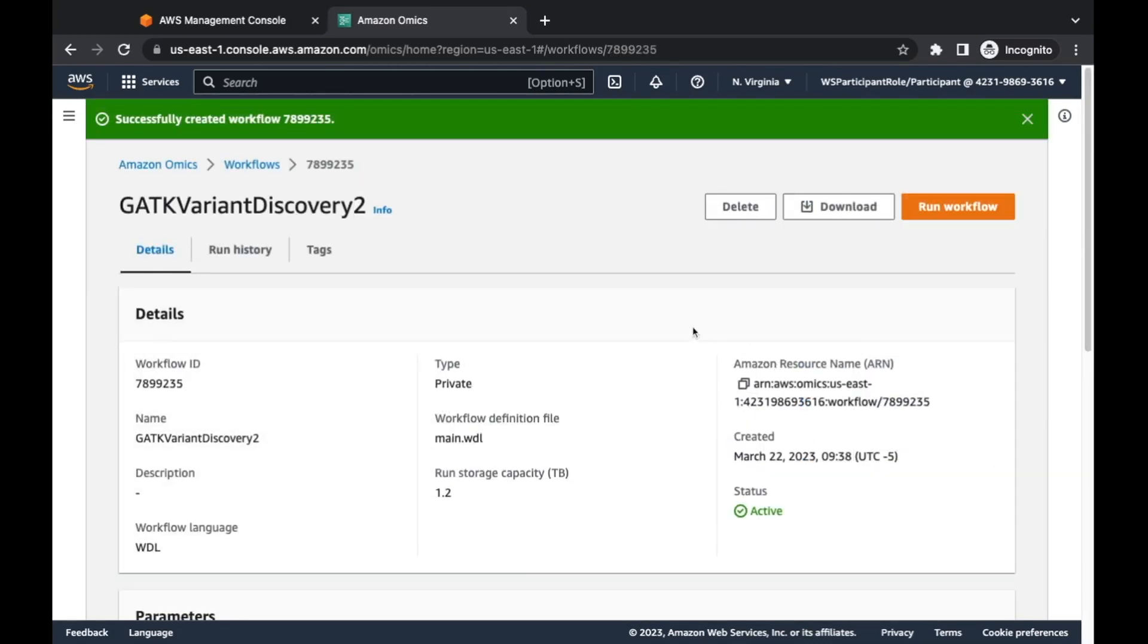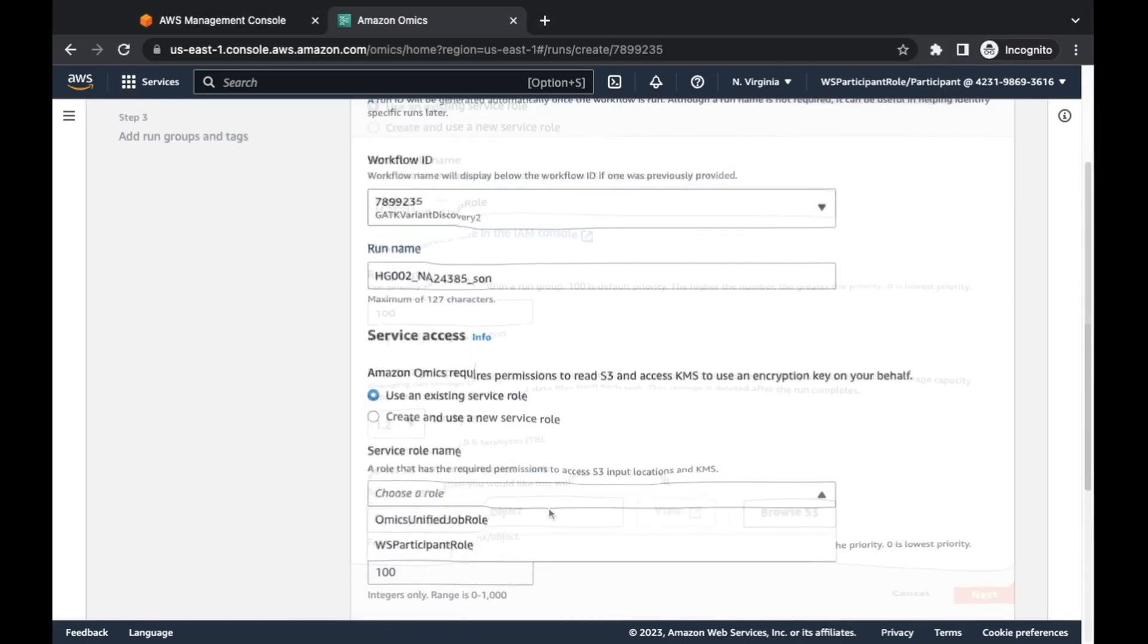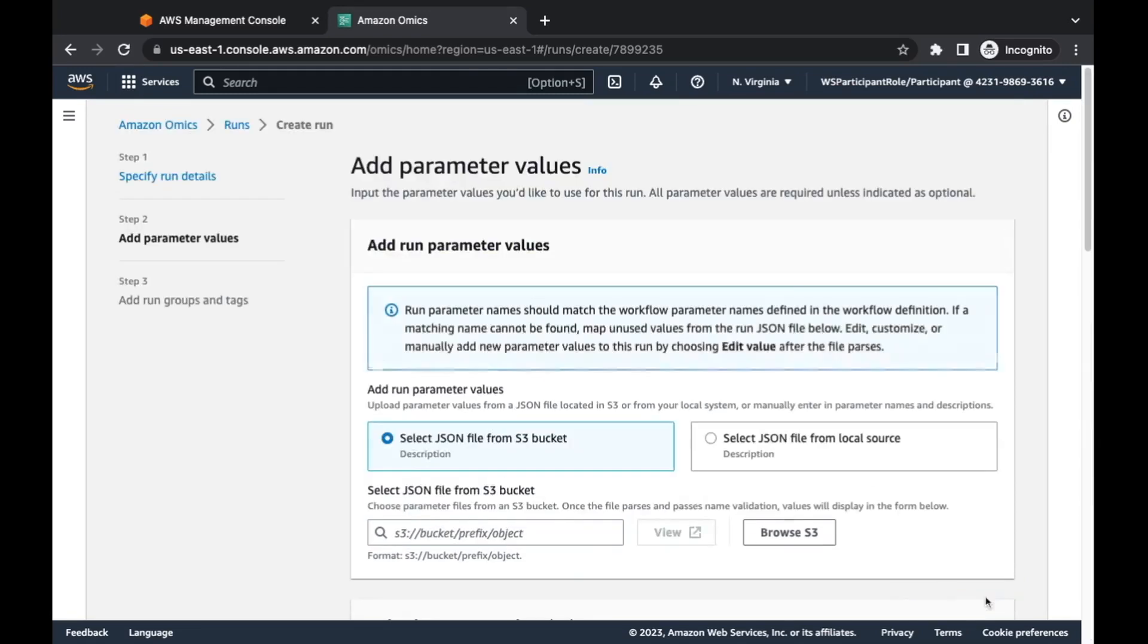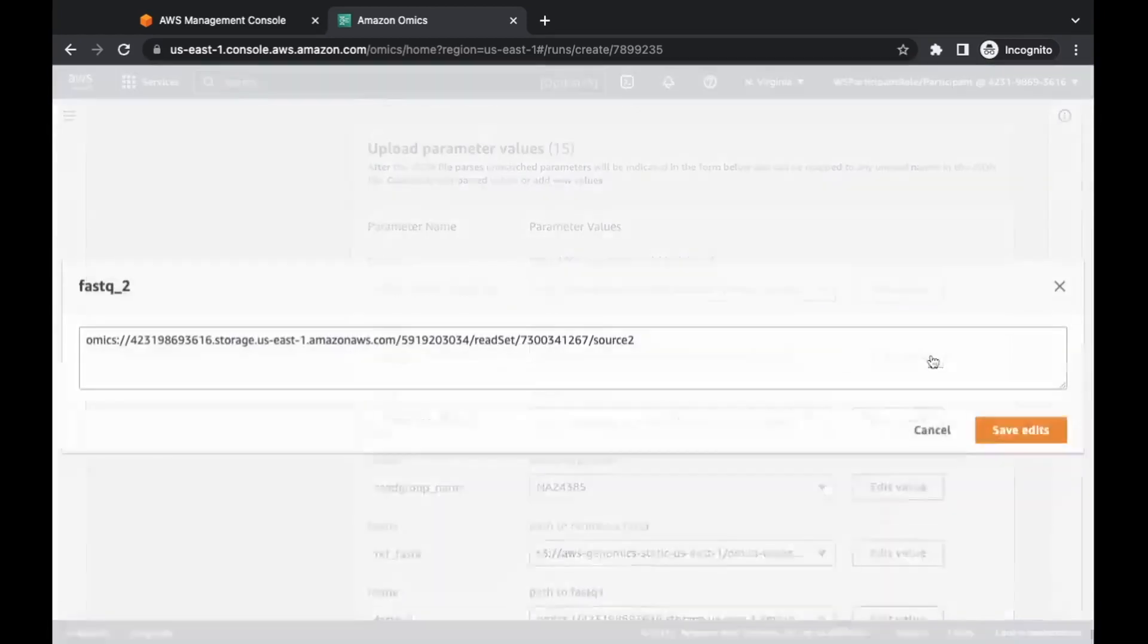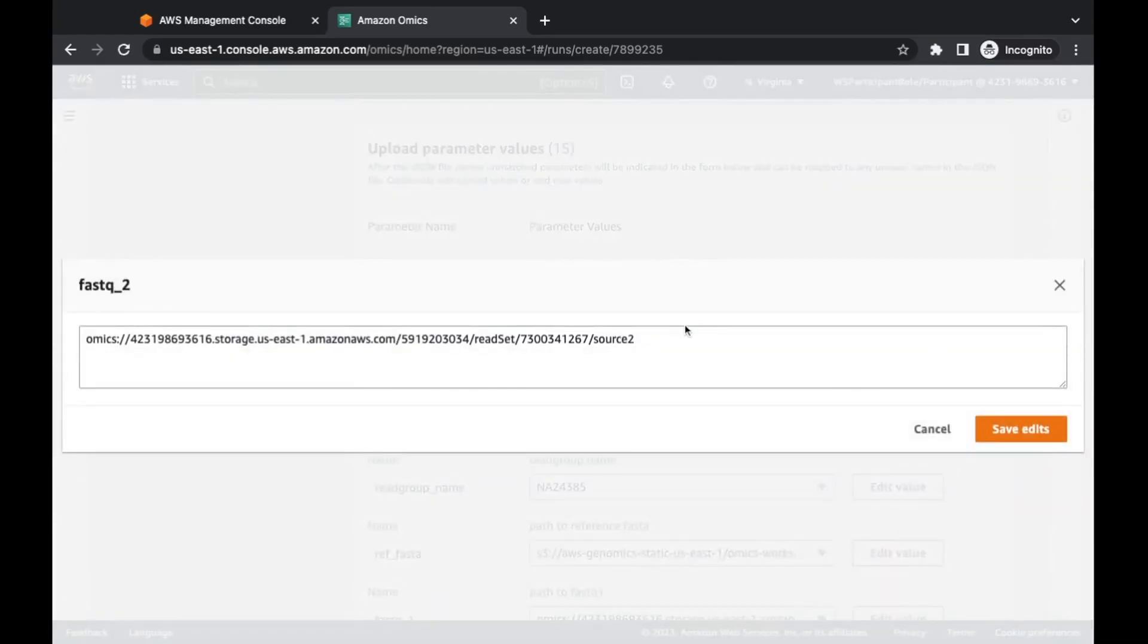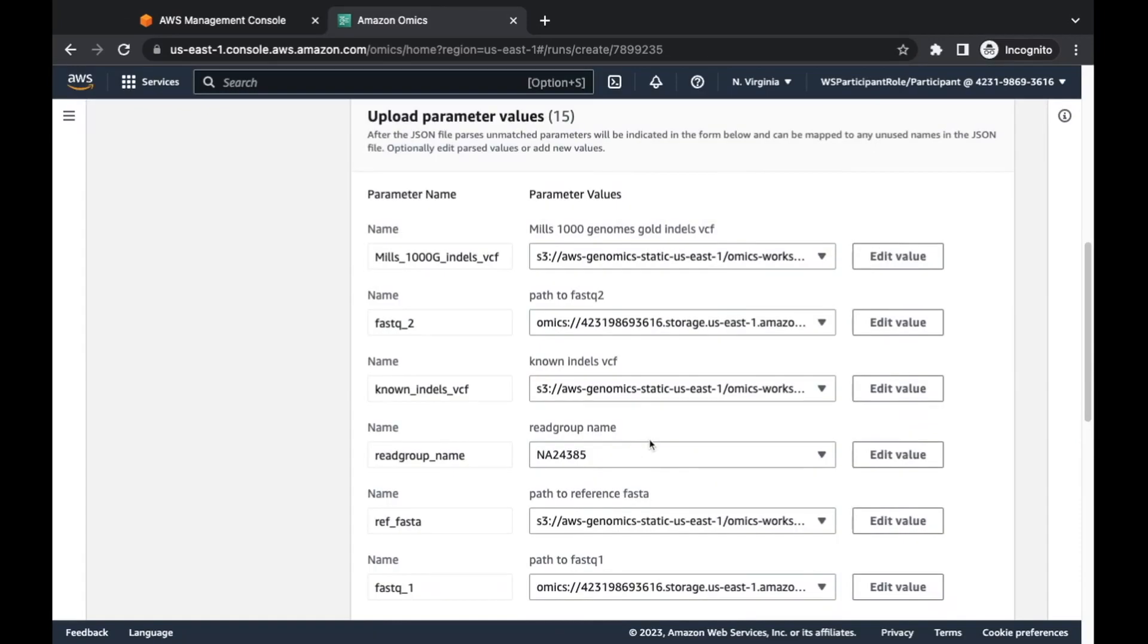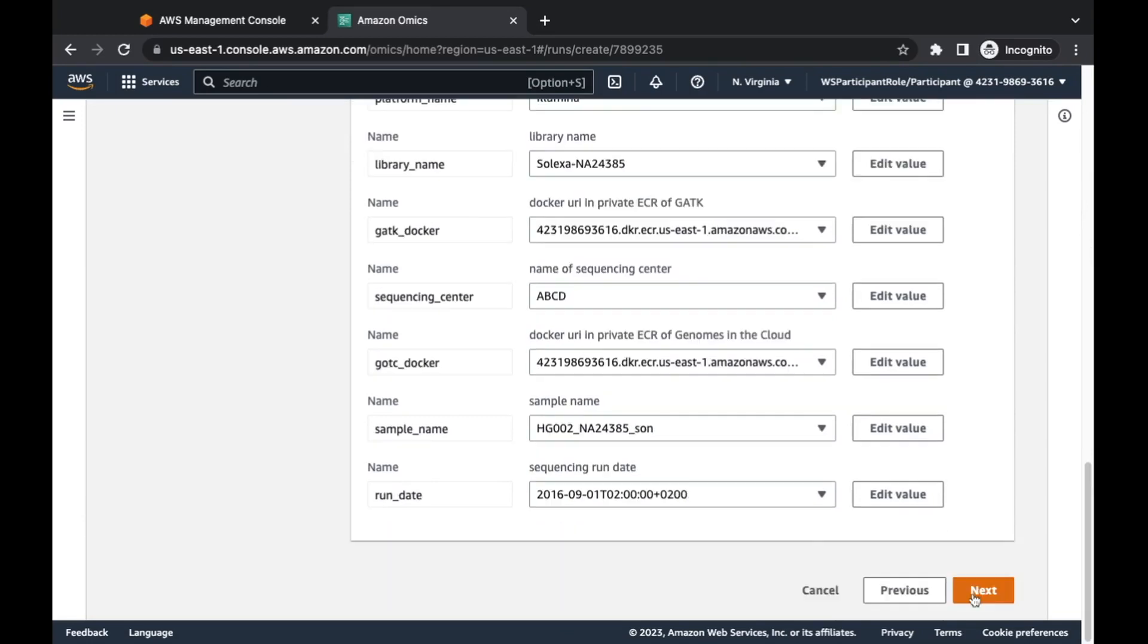If we go down here to workflows in the Omics console, steps are pretty straightforward. You create a workflow, you define what that workflow is supposed to do through specific definitions. We're talking about WDL or Nextflow based workflow definition scripts, define what parameters that workflow is going to take, and then start a run and actually specify real parameter values. So I'll show you what that process looks like. I've created a couple already, but I'll show you what it looks like to create a workflow from scratch.